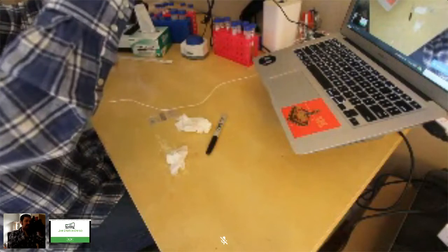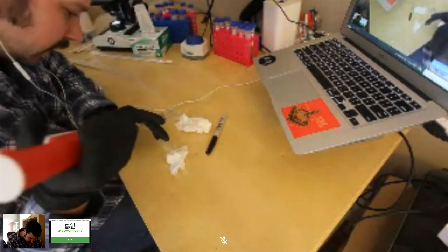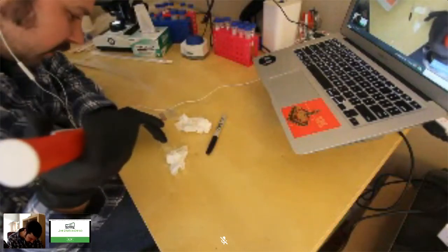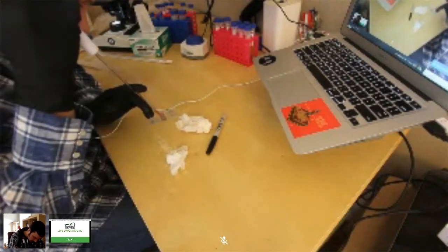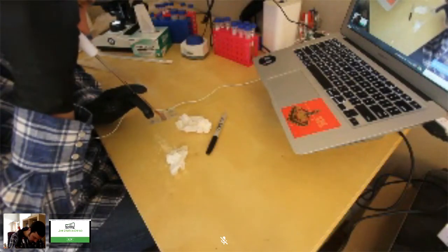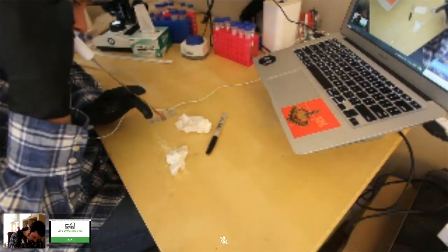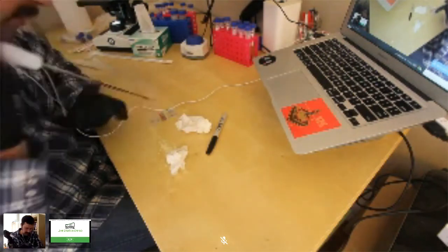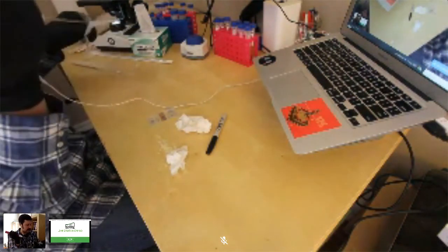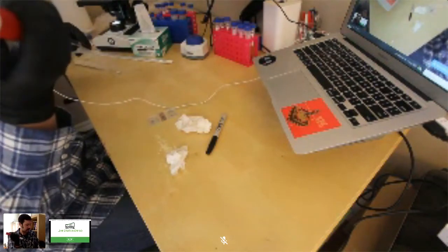So pull a little bit of your fully homogenized sample, and then using capillary action, you're going to load that onto the chamber. What's going to happen is I'm going to put a little bit of liquid on there, and there's a small gap in between the counting chamber and the glass. I load liquid on there, and it sucks the liquid in. You don't have to force the liquid into the counting chamber. The capillary action on its own will do the loading for you.